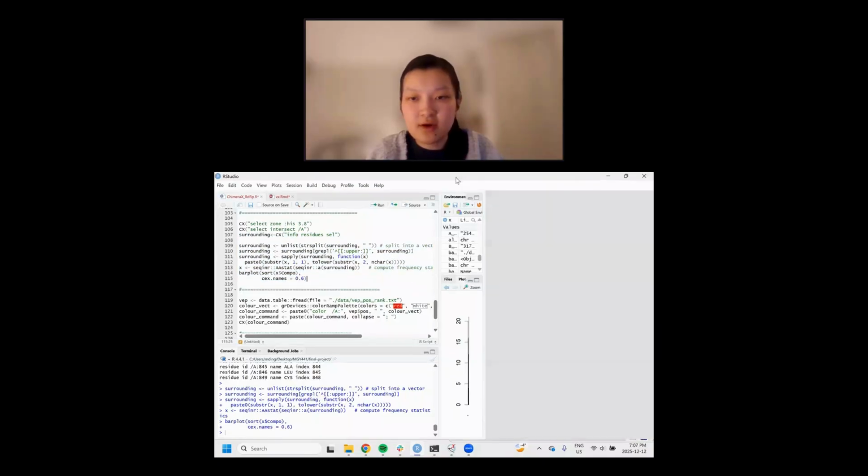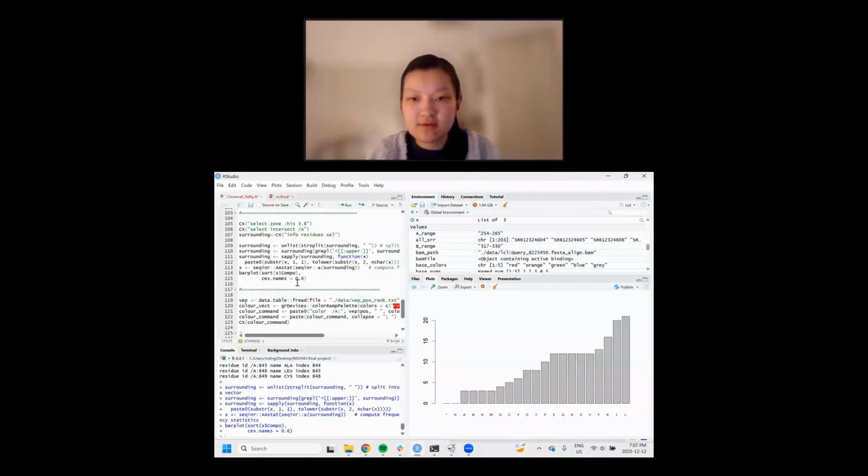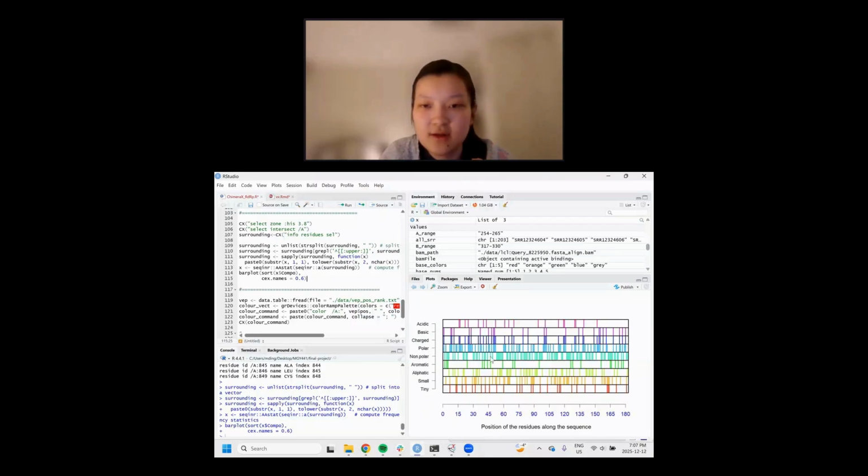And if we open up the R thing, we can see that, first of all, in this bar plot down here that I created, histidine is around a lot of leucine and isoleucine, uncharged, as well as lysine, which is interesting, which might be because they have similar charges and therefore are in similar domains and have similar functions. And then this AA stat plot also just shows the properties of these amino acids that we've selected. And you can see again, it's mostly nonpolar, which is pretty common.